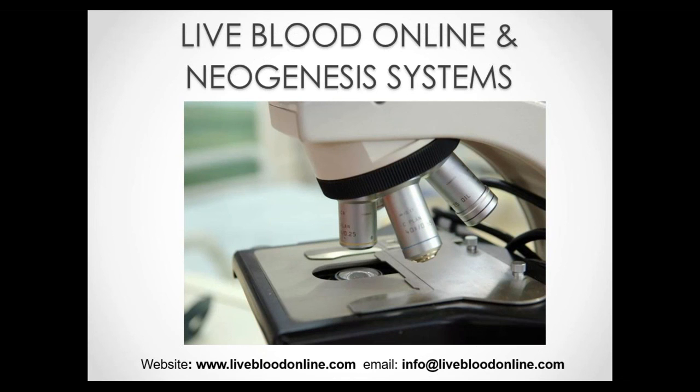The next question is, how close is live blood analysis to normal medical hematology? Well, this is actually quite an interesting question, because, as I said earlier, a fair degree of information in live blood analysis is purely based on standard hematology. So in terms of the specific anomalies that we also see and recognize in conventional hematology, the interpretation would be very similar. But there are also some very fundamental differences. The fact that we're looking at live blood makes a very big difference.